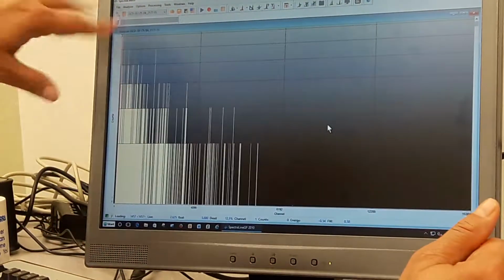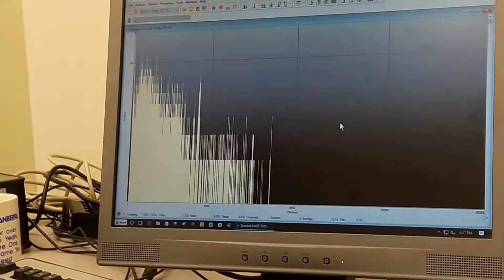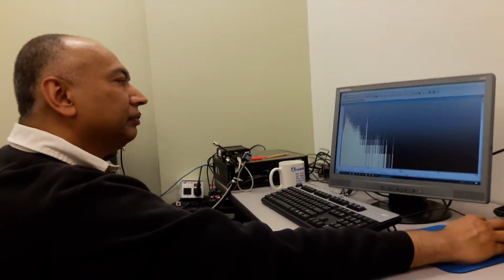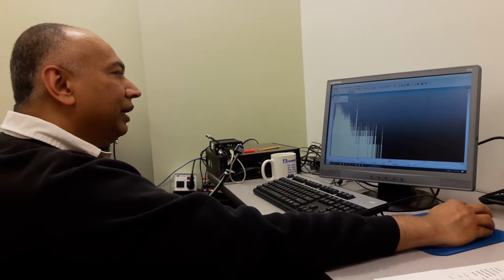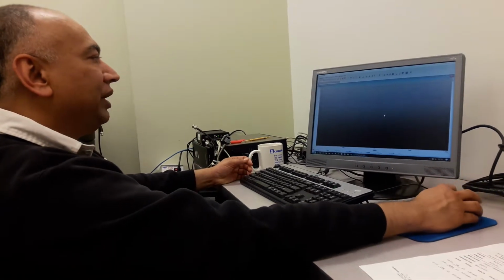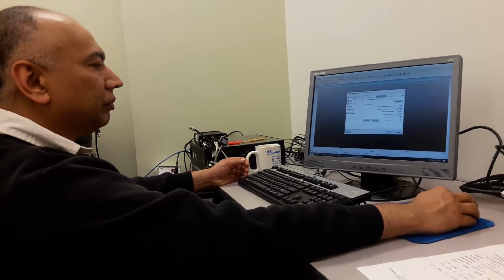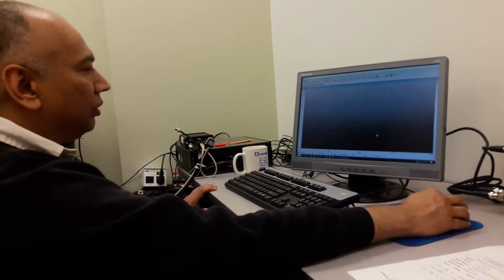Obviously it's going to look funny because my high voltage is 100 volts. It should be 1500 volts. Again, I'm showing you how you go back and start back to the same thing. Now you stop it. You can go ahead and clear it. And what you would do every day, now I can turn my high voltage off. Go to 0, close it.